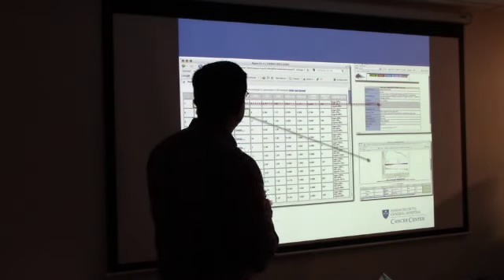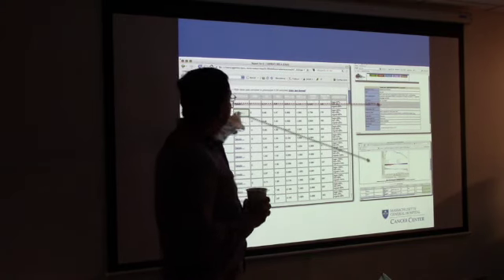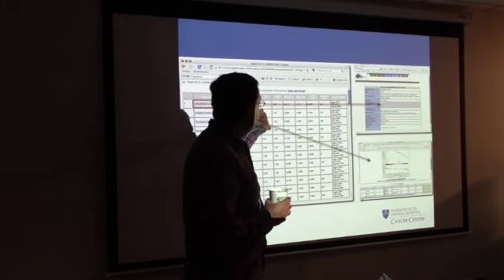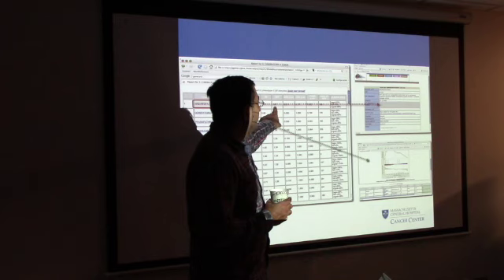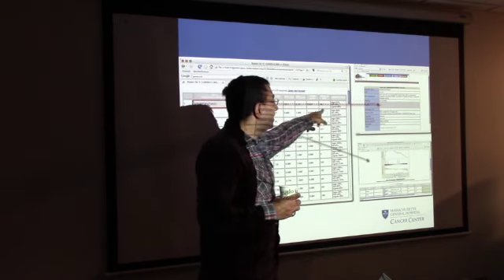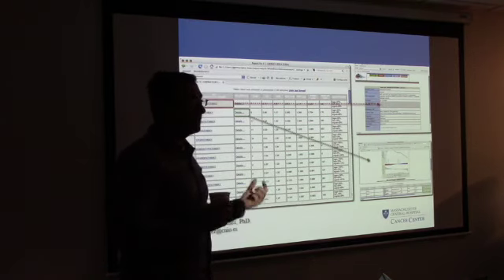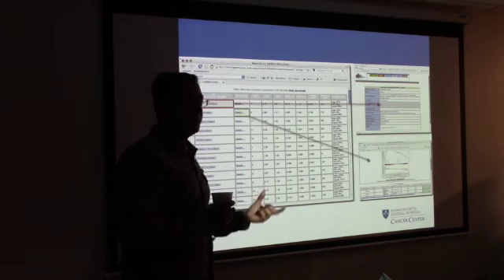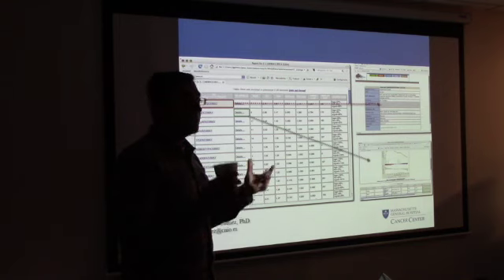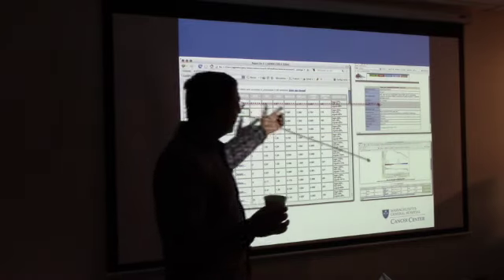And then for each gene set or each pathway, you also have right here the numerics. So this is your enrichment score, this is your normalized enrichment score, and then this is your FDR q-value, p-value. It also tells you your leading edge score, meaning how many of the genes in the leading edge were actually present as a percentage of the total genes. So, in the leading edge, let's say 60% of the genes present in your entire gene set are present in the leading edge. That's a pretty good score to have. So you want to look at those things as well.